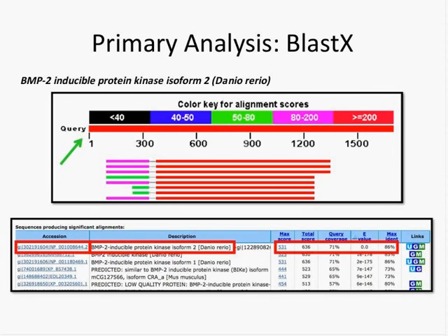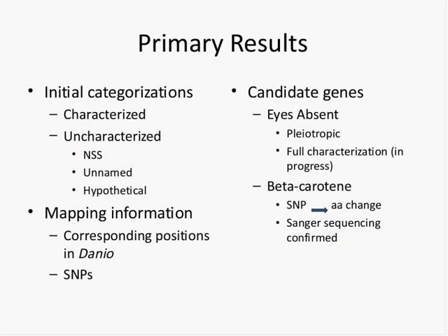And we've taken on a couple of different post-transcriptome analysis strategies. We're currently utilizing BLASTX. However, our first approach was really just a homegrown kind of search and destroy, so to speak, approach, where I had a couple of undergrads taking contigs and just querying the NCBI database, collecting information around the top BLAST hit as demonstrated here, and then assembling these into our own catalog. And since about April of last year, we've now completed the entire catalog.